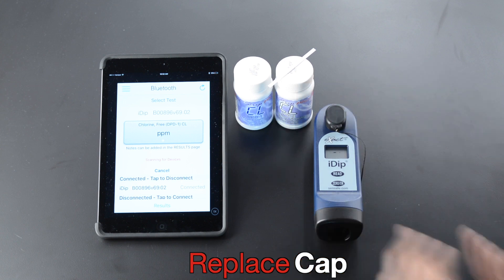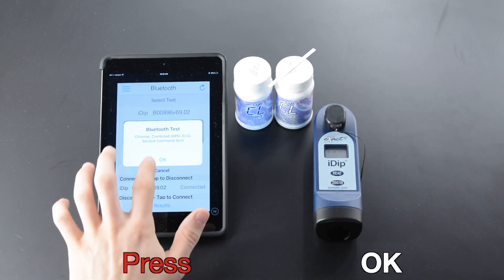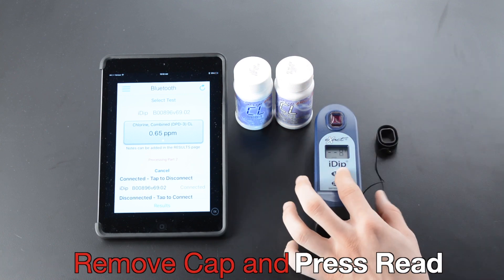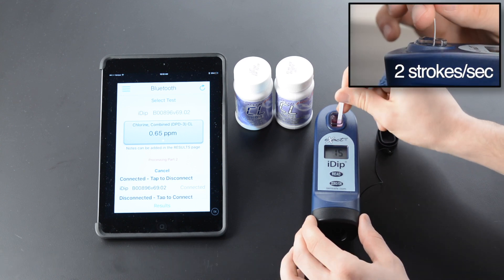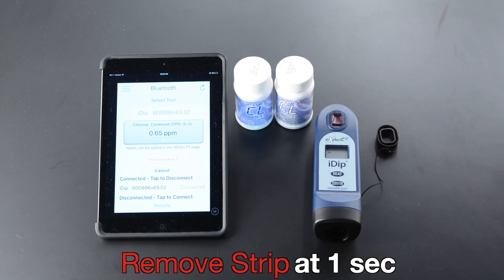Remove strip at one second. Replace cap. Zero XactiDip. Remove cap and press Read. Dip strip. Twenty seconds. Two strokes per second.